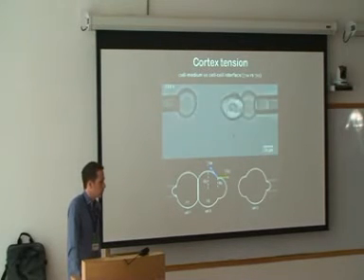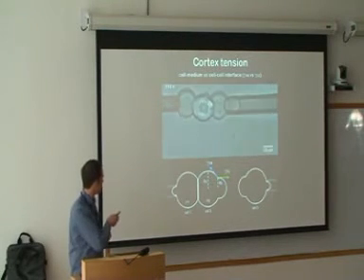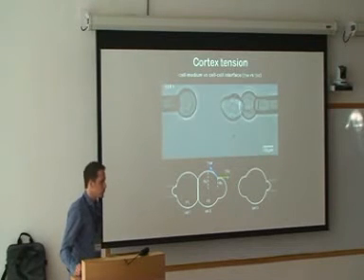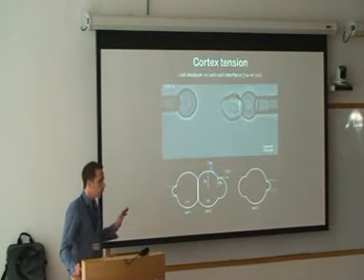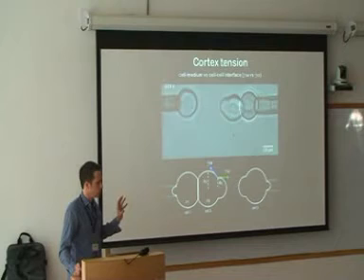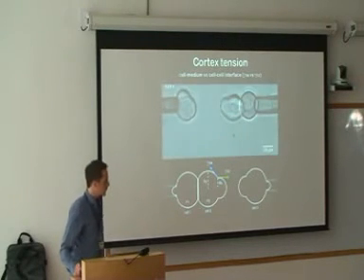I mean, you're gluing the cell via con-A, via lectin to the cantilever. The problem is, of course, this is disruptive here because you're aspirating cells, but gluing cells with lectin is disrupting the adhesive complexes in the cortical organization to a similar extent, which might be very disturbing for cell-cell contact formation. I think all these, you know, the way you hold the cell is always somehow disturbing the system, and that's the way you're doing it with pipettes.